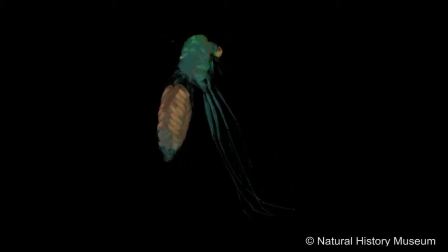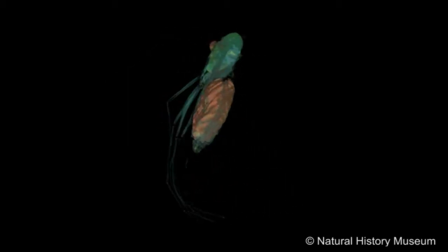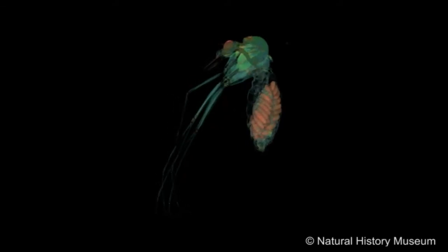The other group of flies that we'll be looking at are black flies and Onchocerca. We have a colony of our sandflies in London. We're having to go to Ghana to get the black flies. And what we'll be looking at is comparing the infection levels in black flies that are found in the savannah and those that are found in forest regions to compare the numbers of L3 larvae inside them. And this should be actually much more easy for the micro-CT system to resolve because these L3 larvae are so huge.